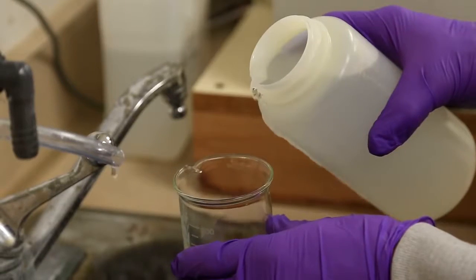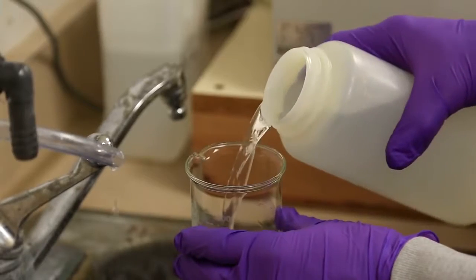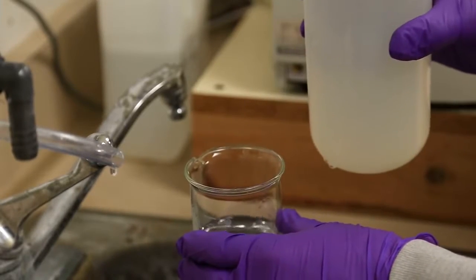Commit. We tend to get all nervous when pouring stuff in the chemistry lab and go all slow with it, but that's terrible. You won't overcome the surface tension and it'll dribble down the side of the container, so just commit. At the beginning and at the end, destroy that surface tension.